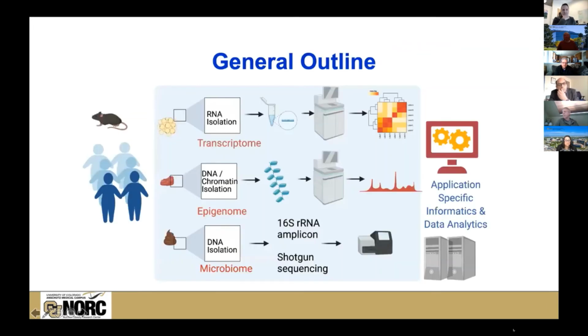So this is a broad schematic of the pipelines that we have in the lab. I'm going to focus on the top one here, which includes bulk RNA sequencing, and I'll walk you through the modular approach we have. But the idea really here is to examine gene expression within tissues. We do this both within human tissues or mouse cells or tissues or in vitro cultures. You can come in with either tissues itself or prepared RNA, and then we can make libraries. We partner with the CU Genomics Core for sequencing services, and then we have our in-house pipeline for data analysis.